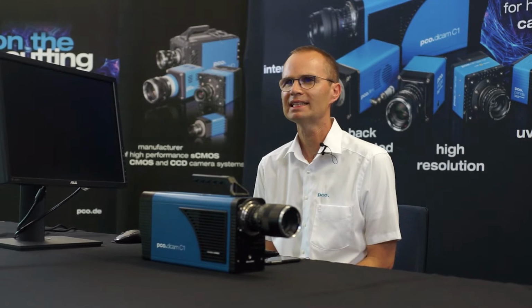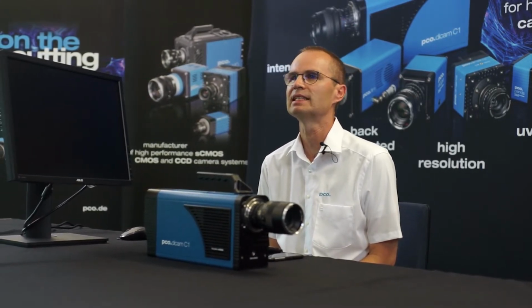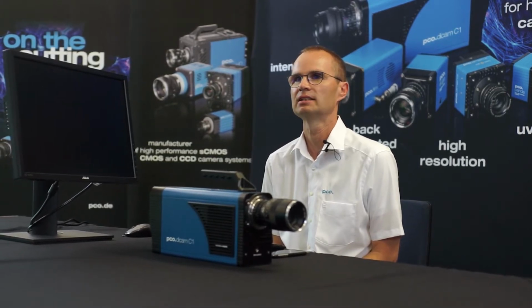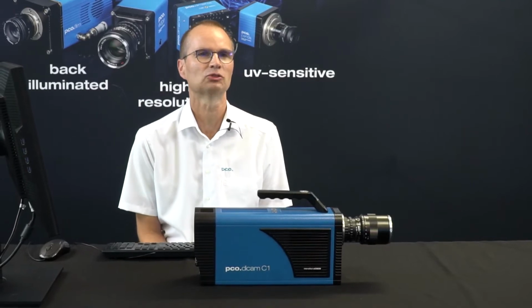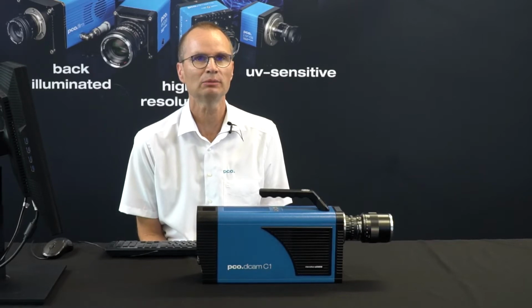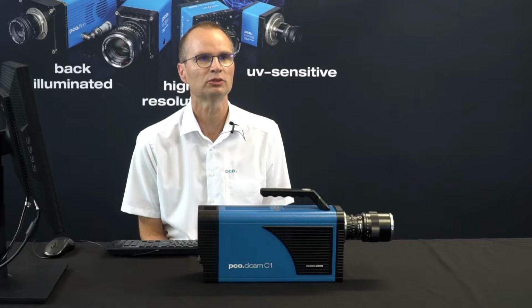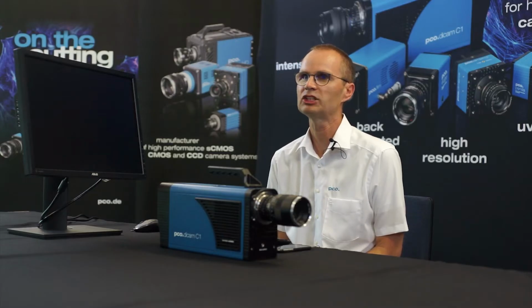But intensification is still useful if photons have to be detected in an extraordinarily short exposure time of a few nanoseconds. EMCCD and CMOS cannot cover this range. Image intensifiers allow such extremely short exposure times, a capability which is often referred to as gating. So the question is, how can light be intensified?